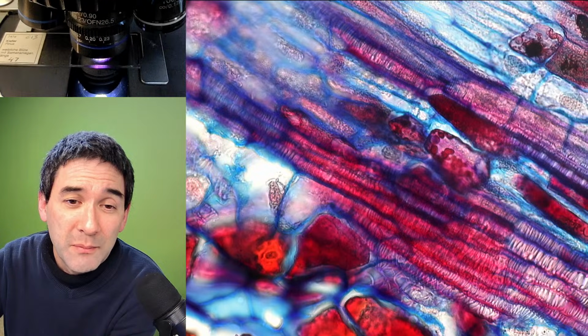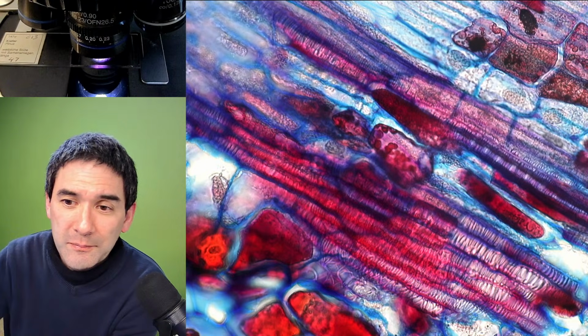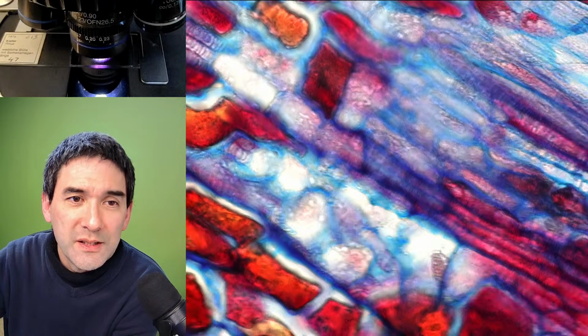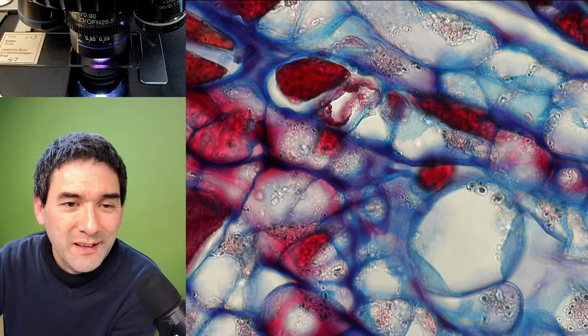And then sometimes when I try to make my slide rings, I don't use a brush, but I actually use a pipette. Yeah. So this is basically again also one of my favorite slides here. Okay. Yeah.